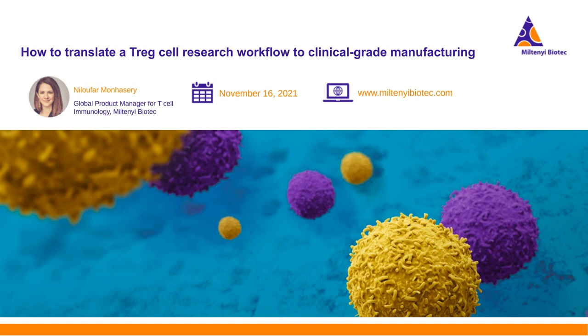This labeling and dilution in the Tyto buffer is automated and in a closed system, which is the reason we highly recommend this sort of automated closed system. But in general, it is possible to use CliniMACS Plus to enrich your cells and then use the Tyto Cell Sorter, but the labeling of the cells in the middle needs to be done manually, and it's not included in the process on CliniMACS Plus.